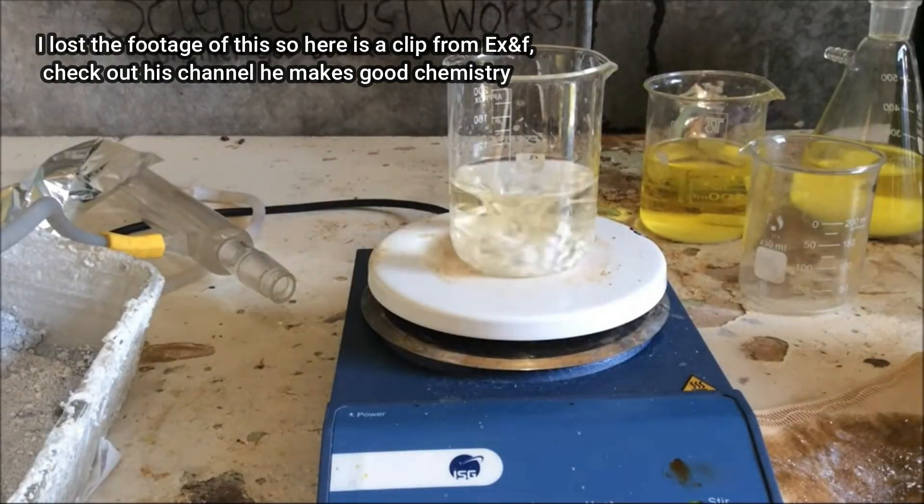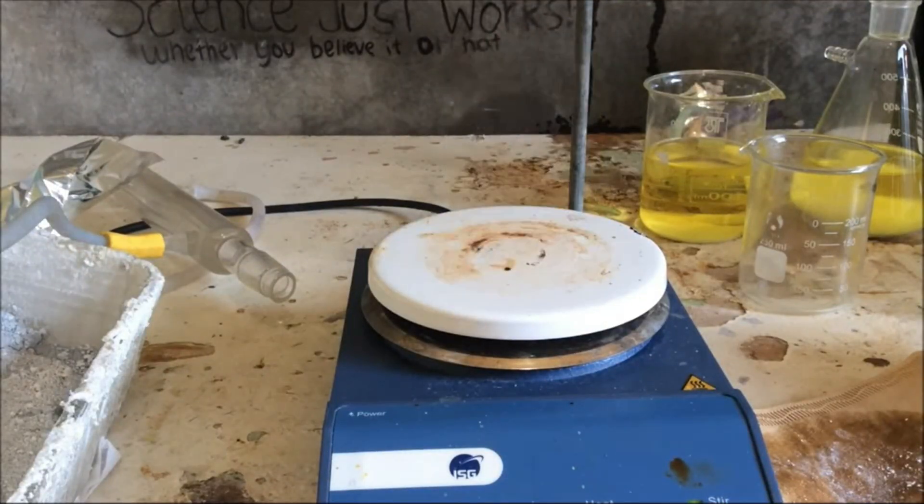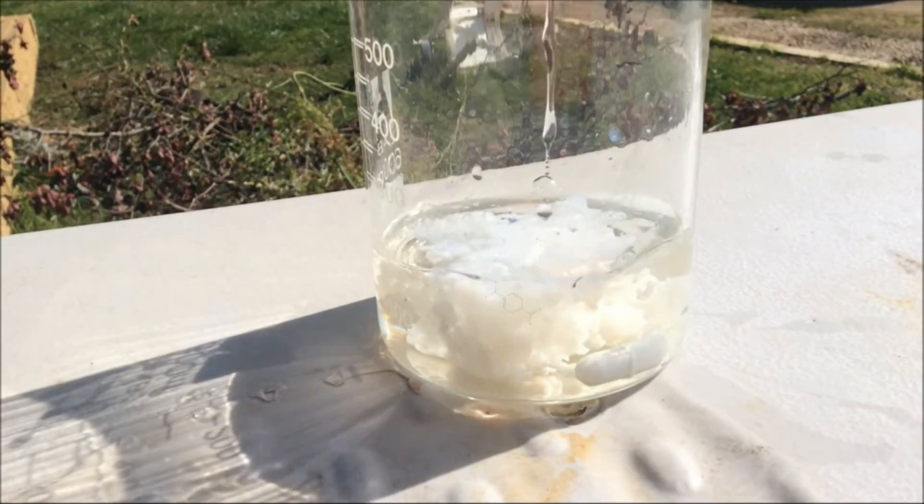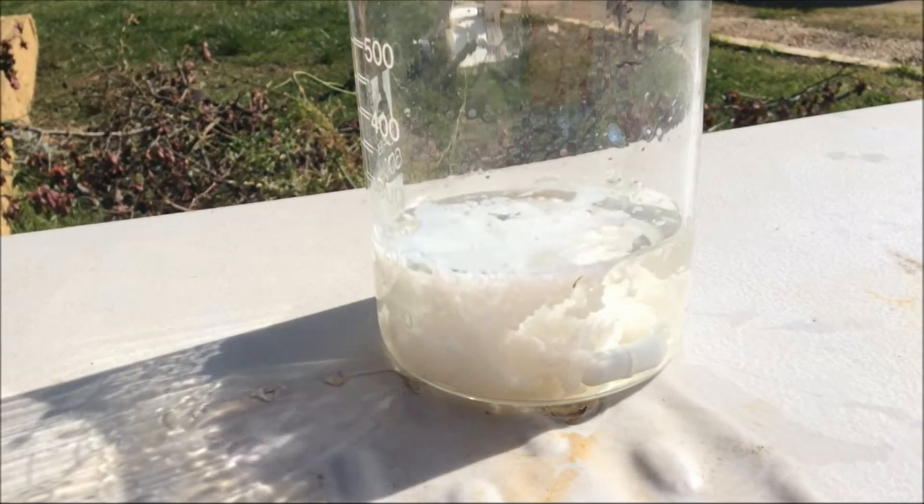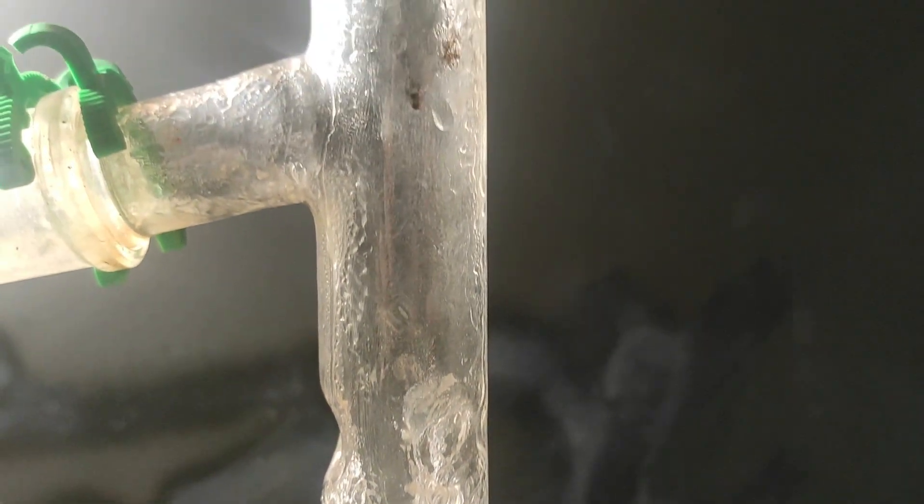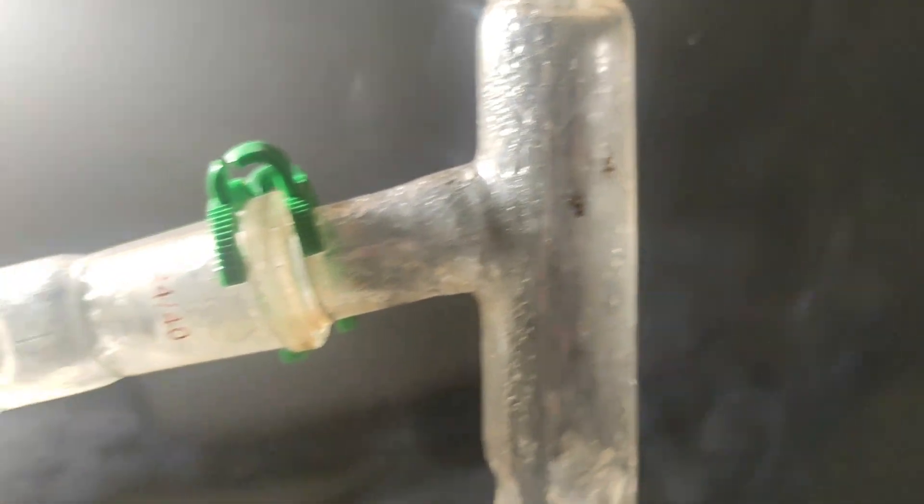The first one is to dissolve the terephthalate in water, and precipitate the terephthalic acid by adding any strong acid like hydrochloric acid or sulfuric acid. This is great if we want some pure terephthalic acid, and it might lead to a better yield if used to make benzene.